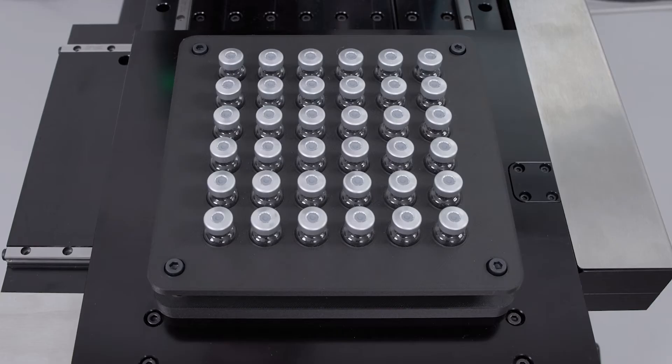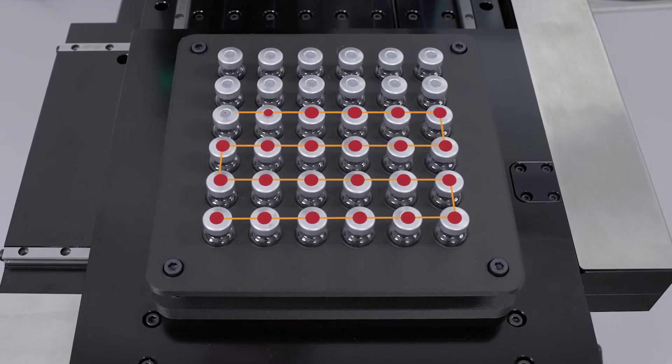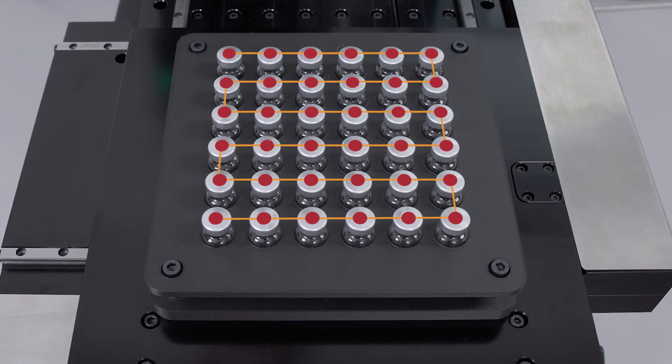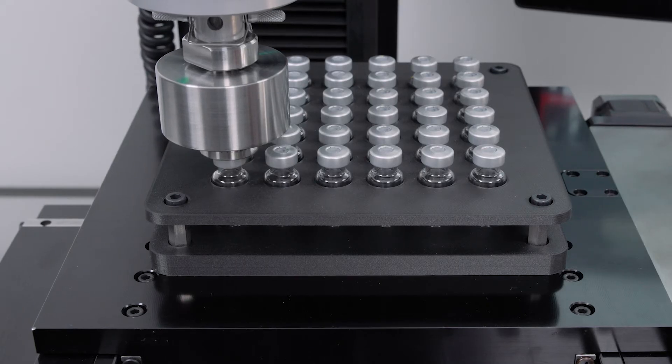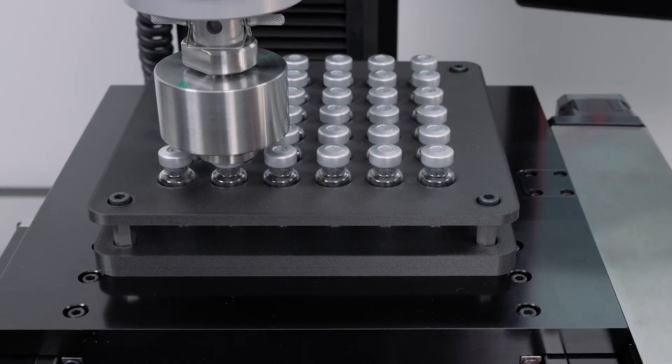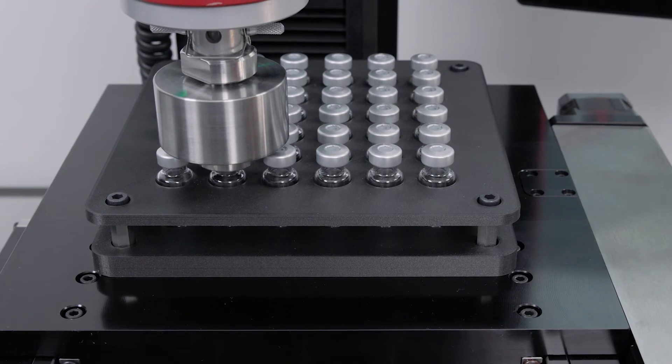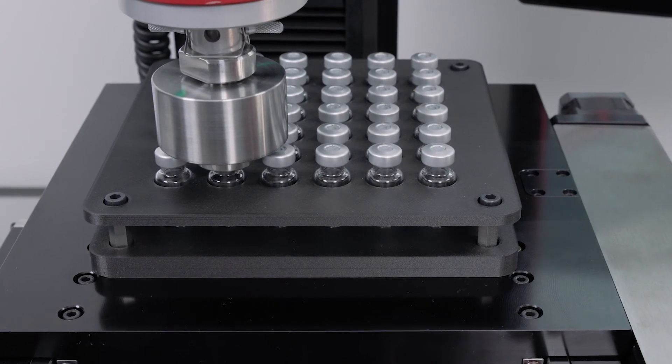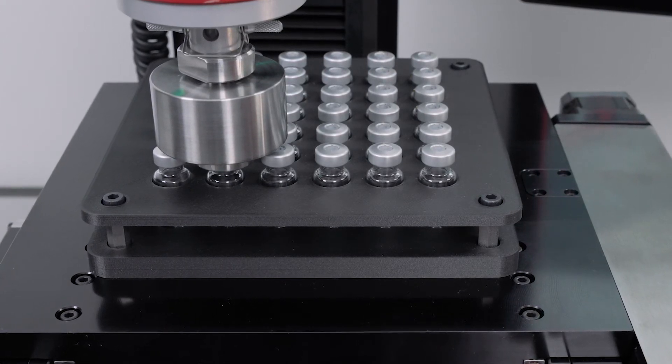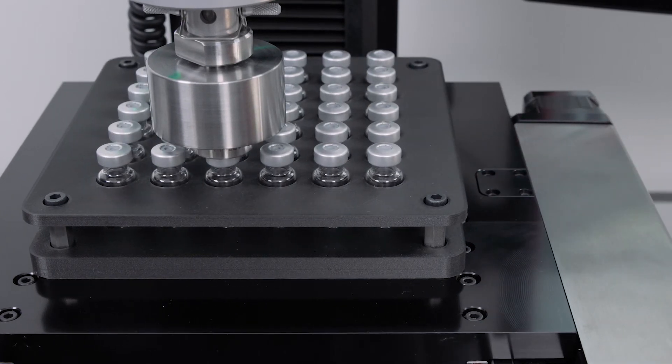Blue Hill Universal is used to program a simple grid sequence to identify the 36 test locations. This sequence is stored in the test method, prompting the XY stage to move to the next location before performing an identical compression residual seal force test on each vial in our batch.